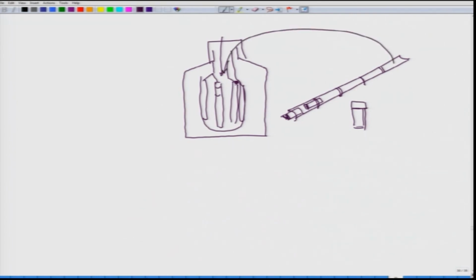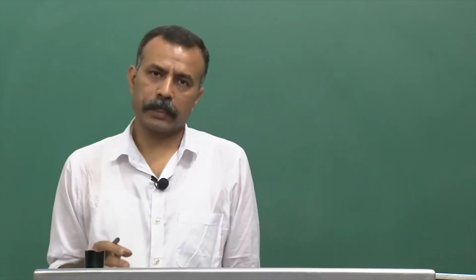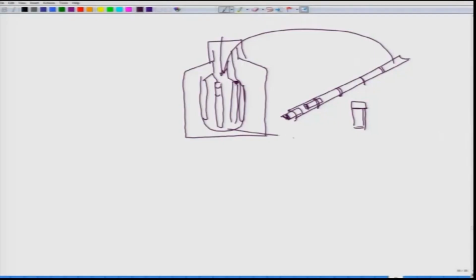Every cell culture lab maintaining cell lines keeps them in these, and they remain at liquid nitrogen temperature, and they can remain for years after years, decades after decades. But the only thing is that you have to ensure liquid nitrogen is supplied from time to time to replenish it, and every time you open it, there is a depletion of the liquid nitrogen.